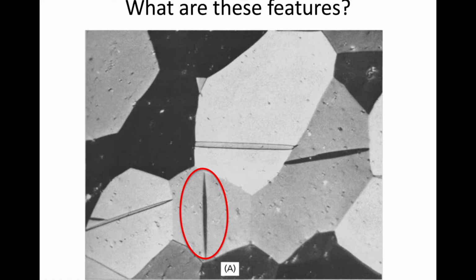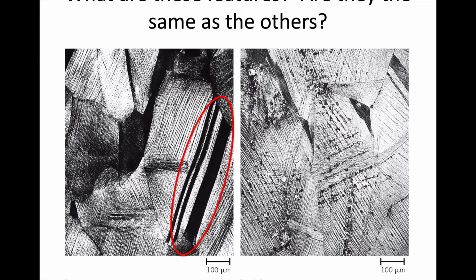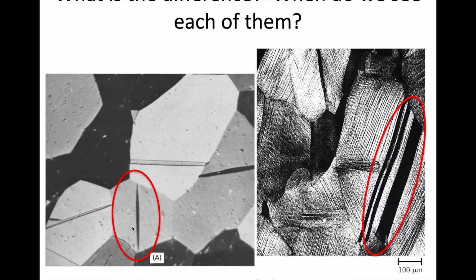But in cartridge brass, we don't tend to see these types. We tend to see the very broad, thick ones that I showed you in the previous images, like this. So I just wanted to throw that out here. I don't expect to see many of these, but that's a mechanical twin. So you can see the difference here: mechanical twin, annealing twin. So it's really a thickness issue in that case. But in both cases, it only goes to the length of the grain.